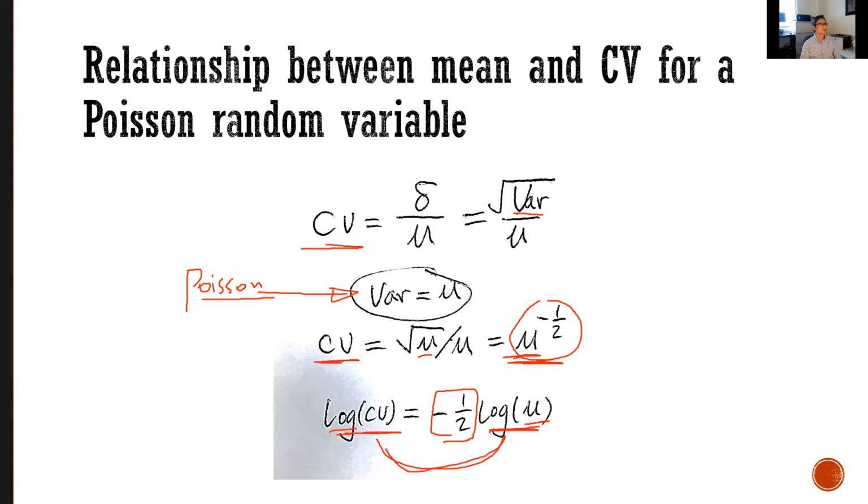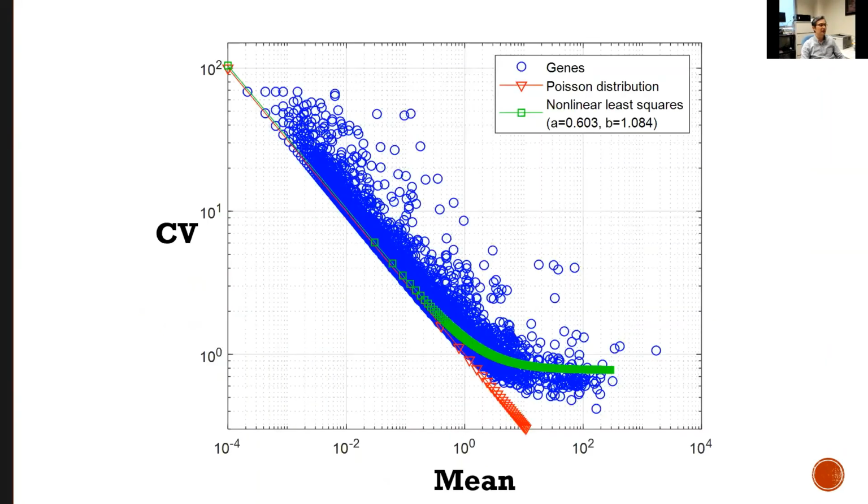Okay, so that's the relationship we are going to use to capture the assumption that these two variables are linearly related across all the genes. This applies to technical variability, and technical variability gives you data which follows the Poisson distribution. So let's put them together.